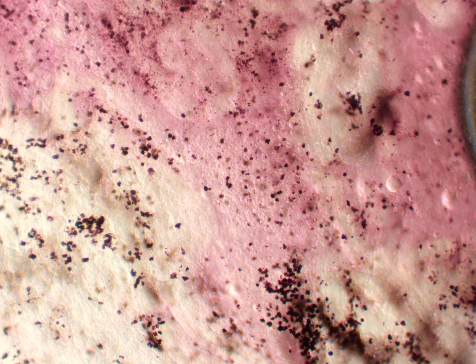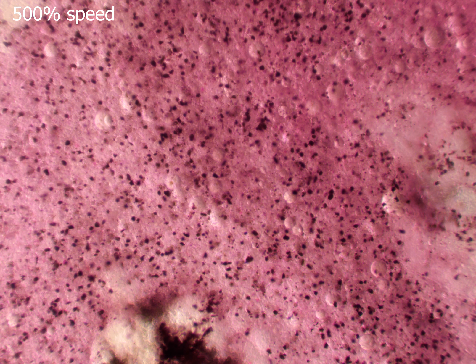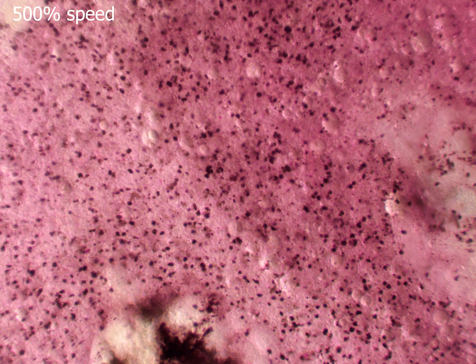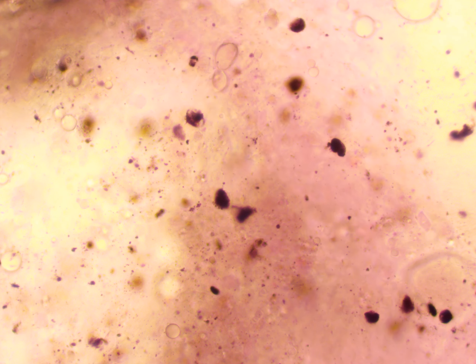You can see its blood here moving very slowly, and you can see how it's black. I don't know if that's natural or not — it could be because this was exposed to oxygen for a long time. Here is another clip; it's sped up 500% speed. You can see how it is moving. Sorry that it's shaking so violently — my brother was playing soccer while I made this.